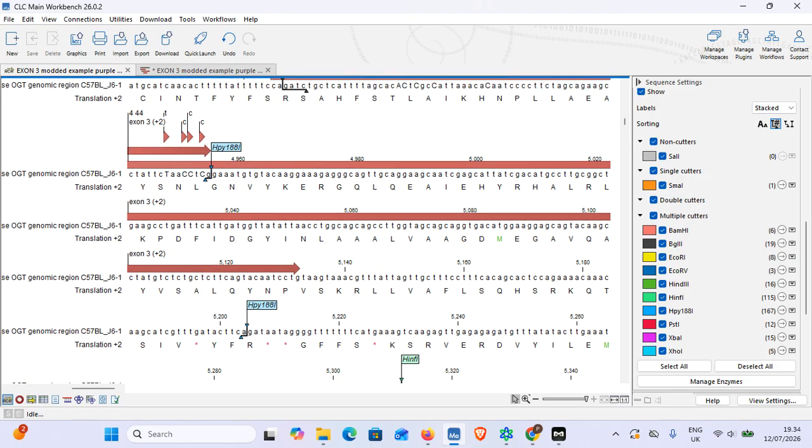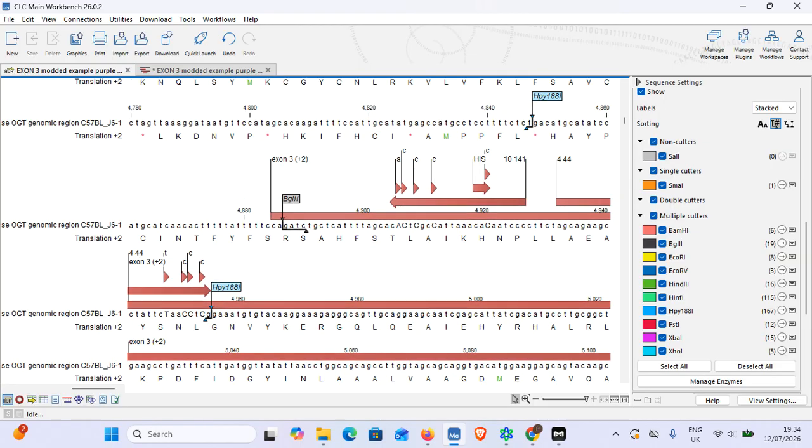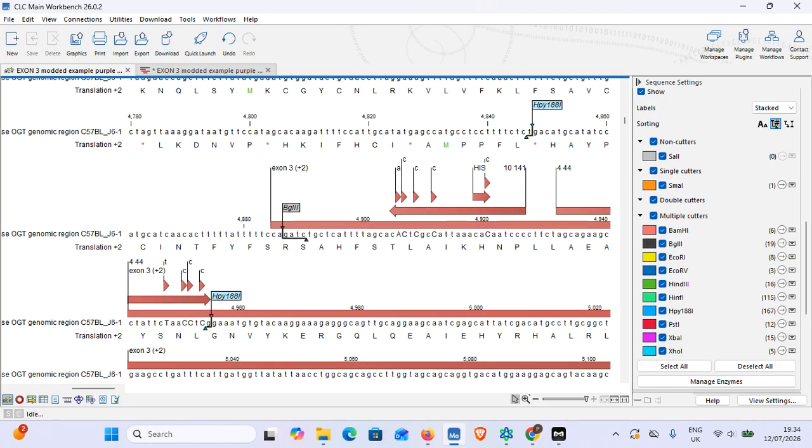So that is the take-home message from this, is that once you've incorporated all of your changes for the CRISPR modification, you have to do this due diligence to check, okay, what sites are lost, what sites are gained, have I done something foolish? Because it can happen. You can accidentally abolish one site and reintroduce it at the other guide RNA. I've seen it happen.